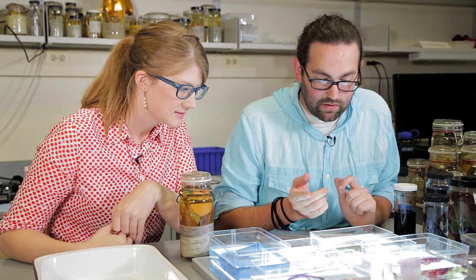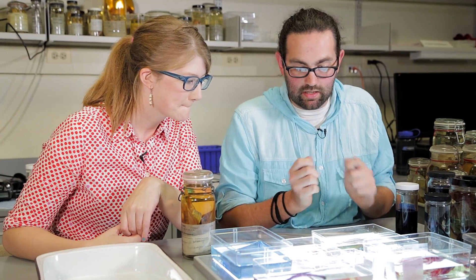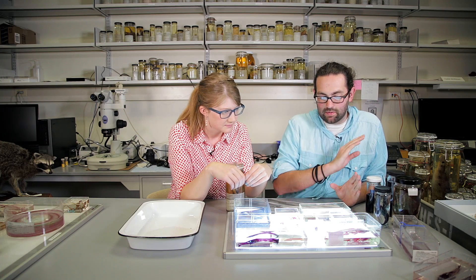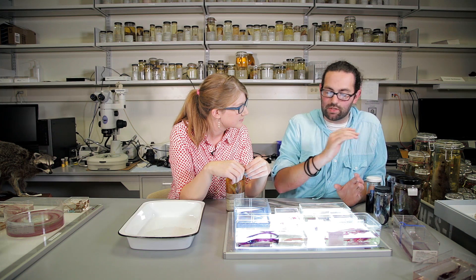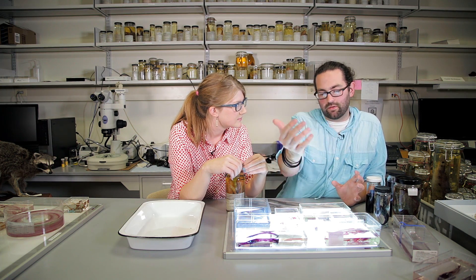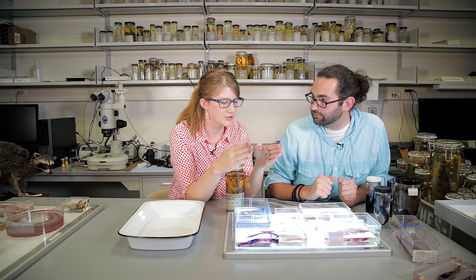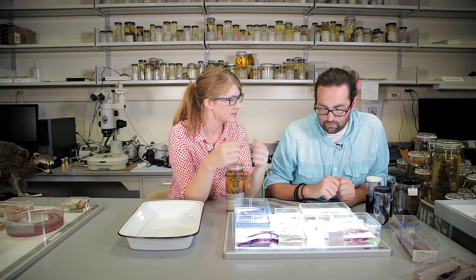Sometimes the location of certain cartilages, or how they vary across different species or groups of species, can tell you a lot about their evolution, development, and anatomy. In fishes, larvae often look nothing like the adults, so you can track how certain bones change through development and how the general morphology of the fish changes — and those make really interesting studies.